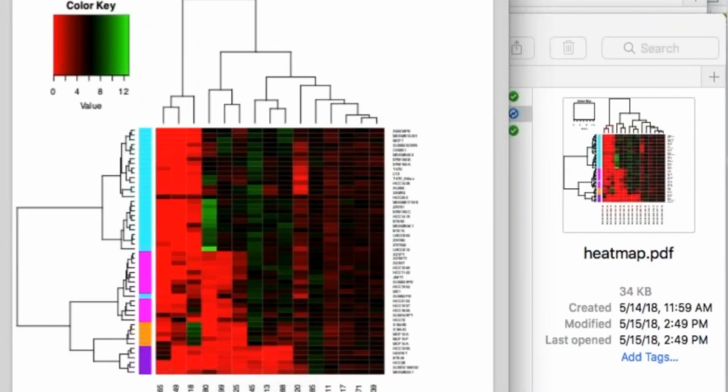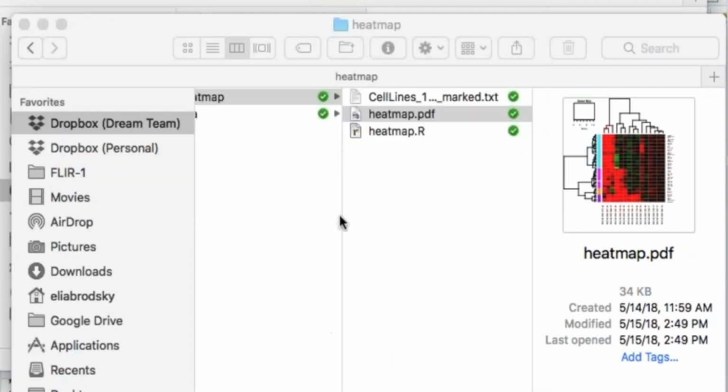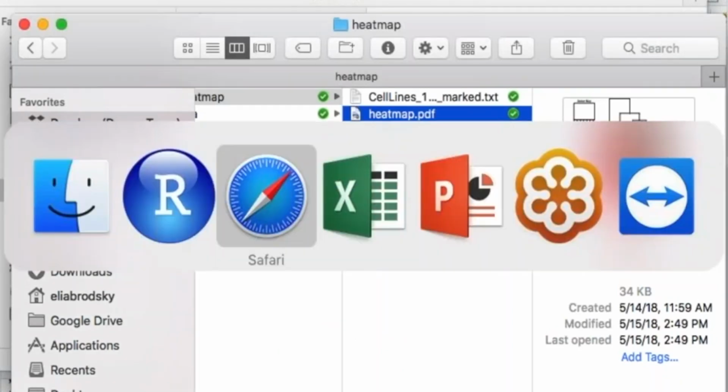And now you see the power of R, compared with an Excel plot. Here we have some hierarchical clustering, which orders these rows. And here we see some groups that are all red. Here we see green, and they are all sorted in the proper way. So let us see how it works and which options we have.